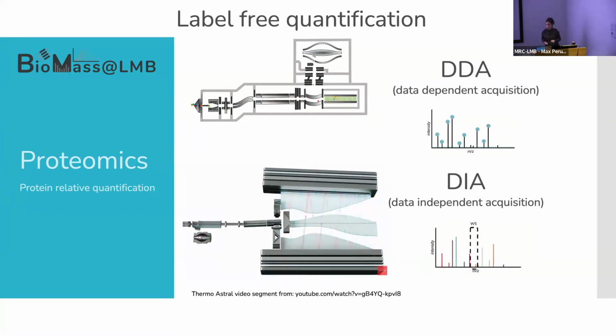So what's the problem here? Well, obviously, these mass specs are really, really expensive. They are really sensitive. They are really fast. You can have a full proteome coverage in 15 minutes instead of 3 days. For quantitative accuracy, you probably need to extend this time a little bit more, but they are really, really fast.